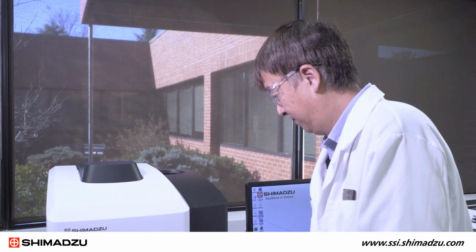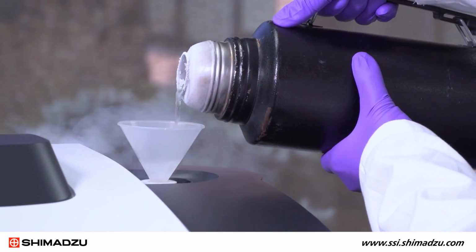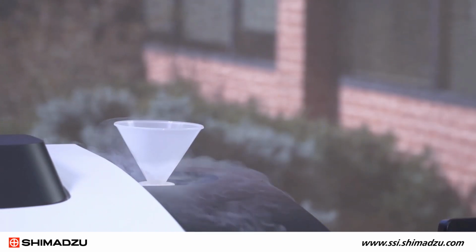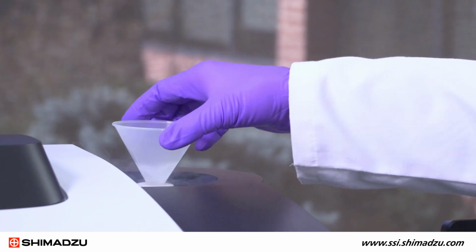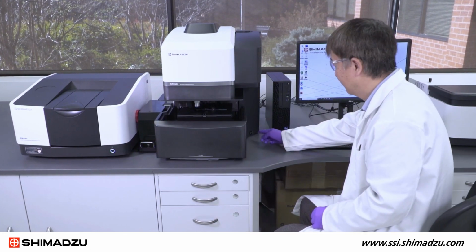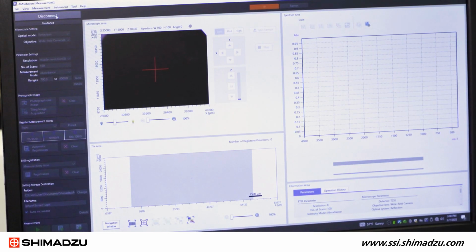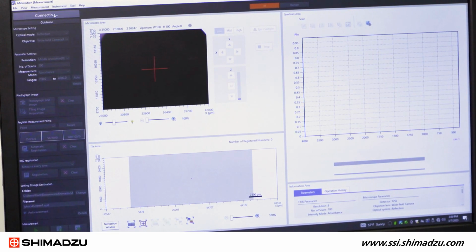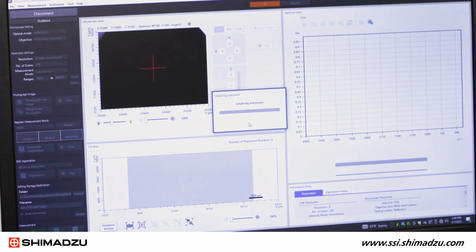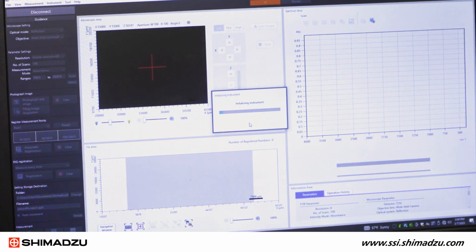Before you begin IR measurement, pour liquid nitrogen into the dewar to prepare for the superlattice detector. Switch on the FTIR bench and the AIRsight microscope. Launch the measurement program by double-clicking the AMsolution measurement icon. In the measurement parameter area, click the Disconnect button to initialize the microscope. If initialization is successful, the Disconnect tab will change to Ready.